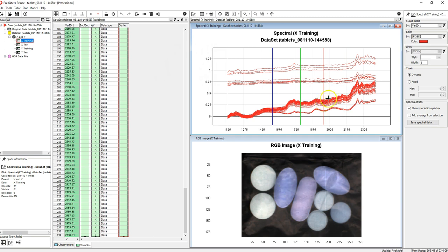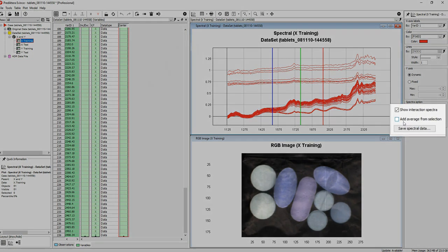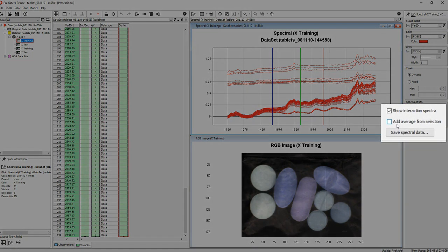In the settings menu for the spectral plot you can select to visualize the average spectra of a region rather than for each pixel.